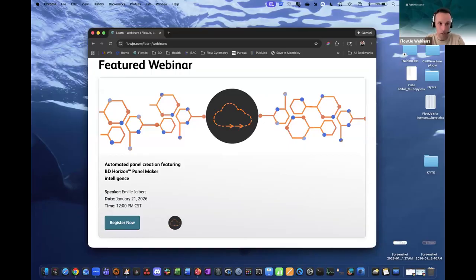That's the only thing we look at. Your cells are coming randomly through your instrument, so if we take a small time bin of your sample, it should be the same at the beginning of the run as at the end of the run. If there's some variability, that means there's an issue on the instrument, and that's where we remove that part of the sample. So it's not cell type specific.